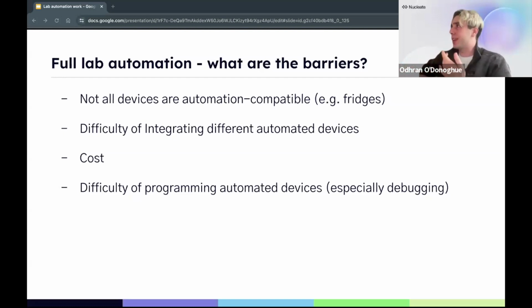Another thing, of course, is cost. A lot of lab automation equipment is expensive. An Opentrons itself is around $15,000. Based on the science you want to do, that may be a drop in the ocean, but for other scientists, if you're trying to automate the whole lab, that's a very big investment, especially if you're doing just one type of experiment, which you may only be doing for a few months as part of iterative testing in a PhD.